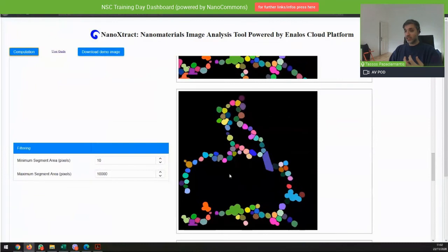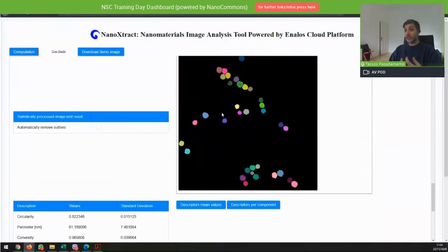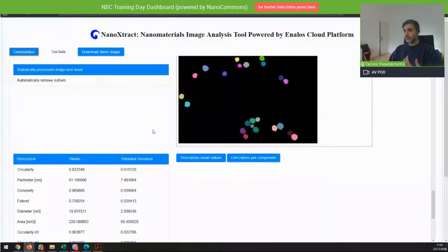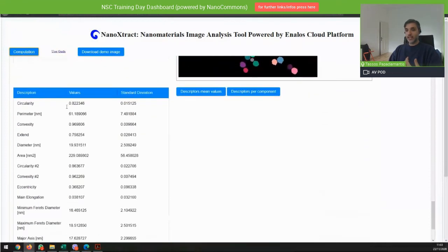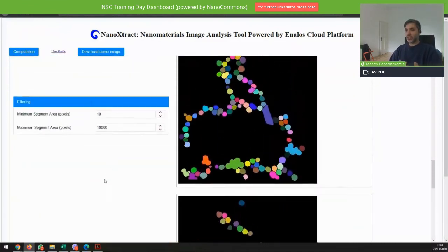And in this case, as you can see again, we move forward, and then eventually we'll get a good splitting, because by applying the cutoff values, you can remove anything that doesn't look right, like large aggregates and so on. And again, you can get the results, and you can see that we have a small change in the diameter, let's say, of around 0.1.